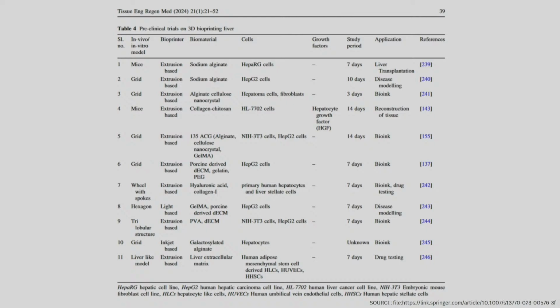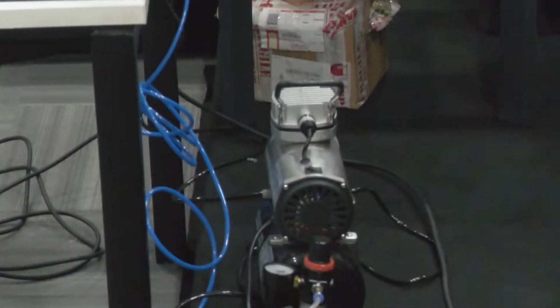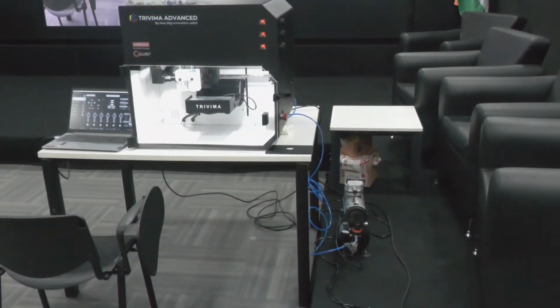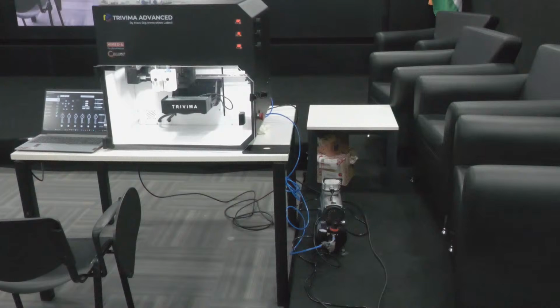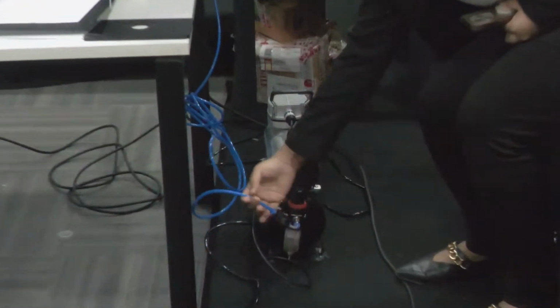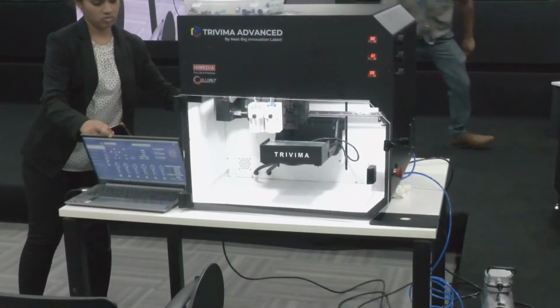Yeah, you can maybe point it. Yeah, so you can point it to the compressor as well. I think you can just take them through, just point it. Anyway, after this we have a demonstration where we'll show it to you, but just show them the inlet and outlet quickly. So that's the compressor, right? Now the inlet into the machine, that's from where the compressed air goes inside the machine. And outside, if you can show the extruder heads also, Ashwini.